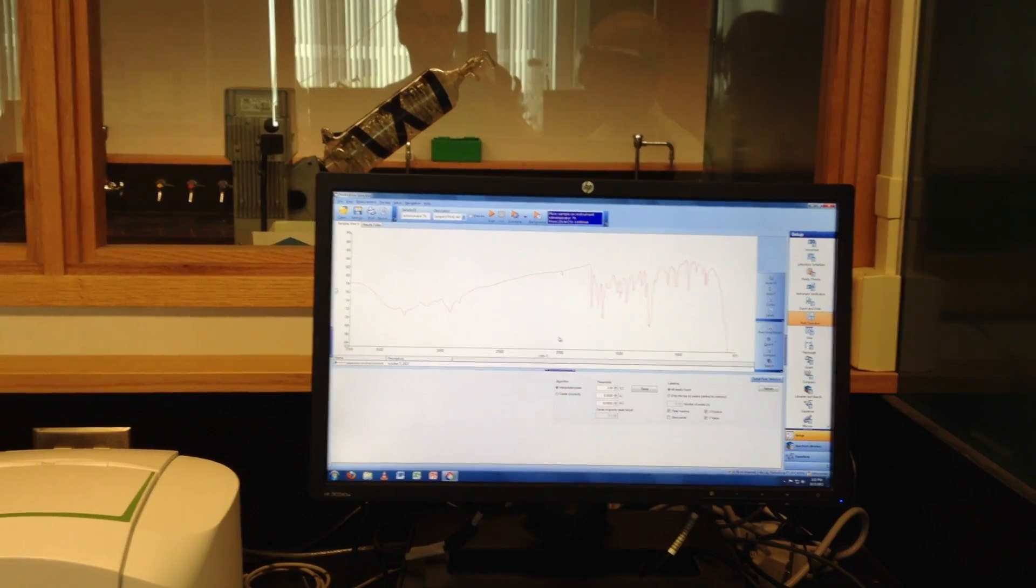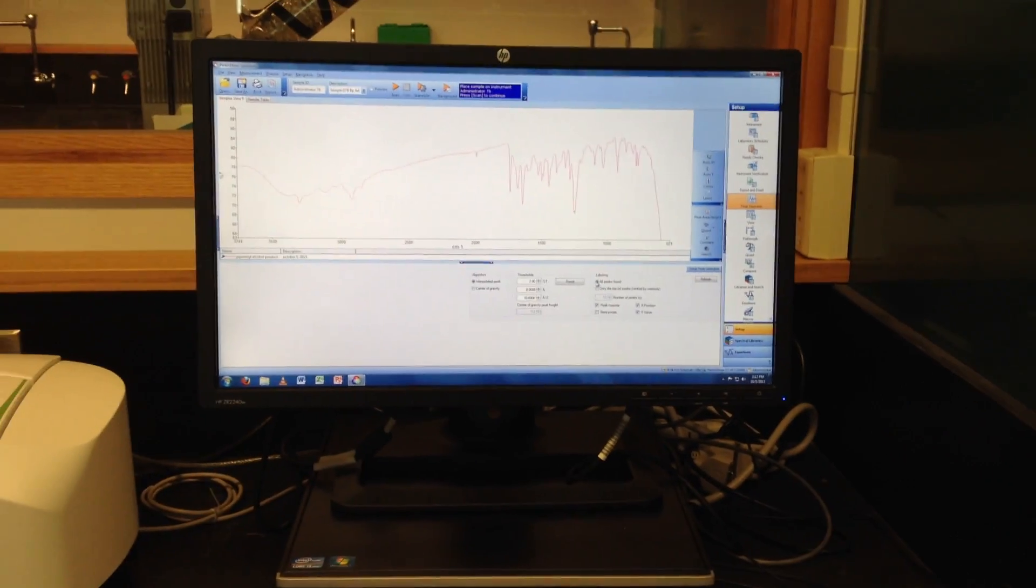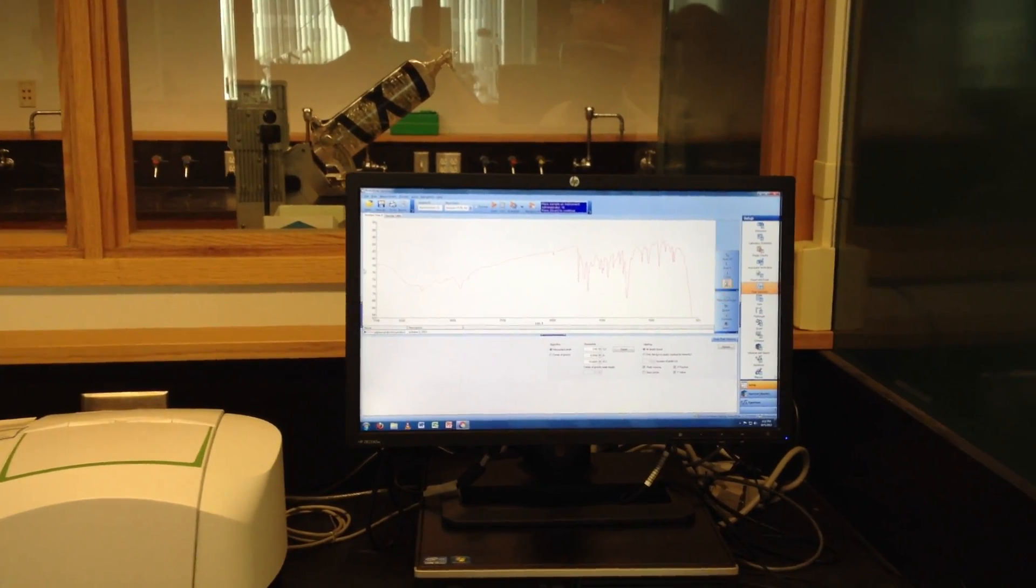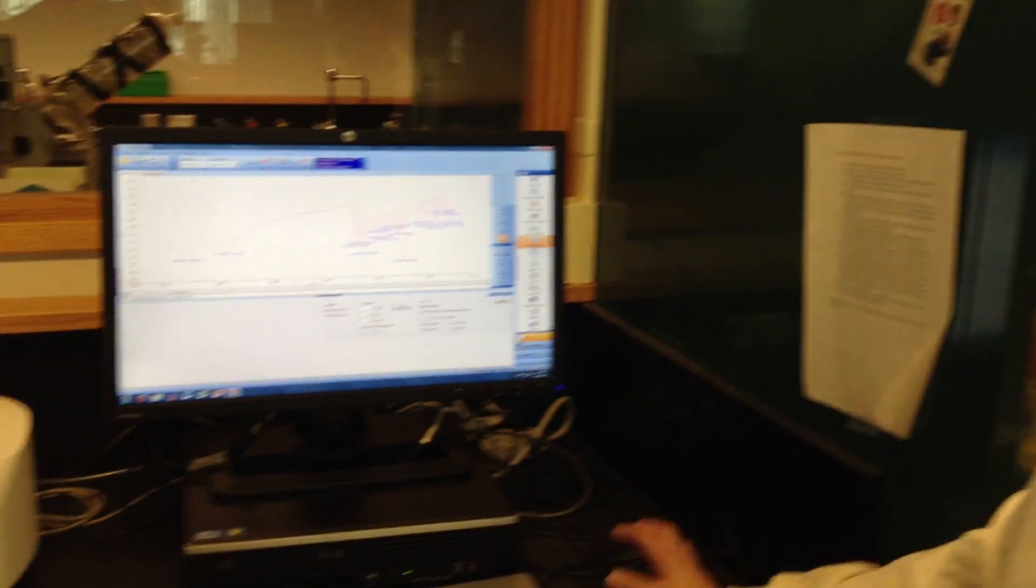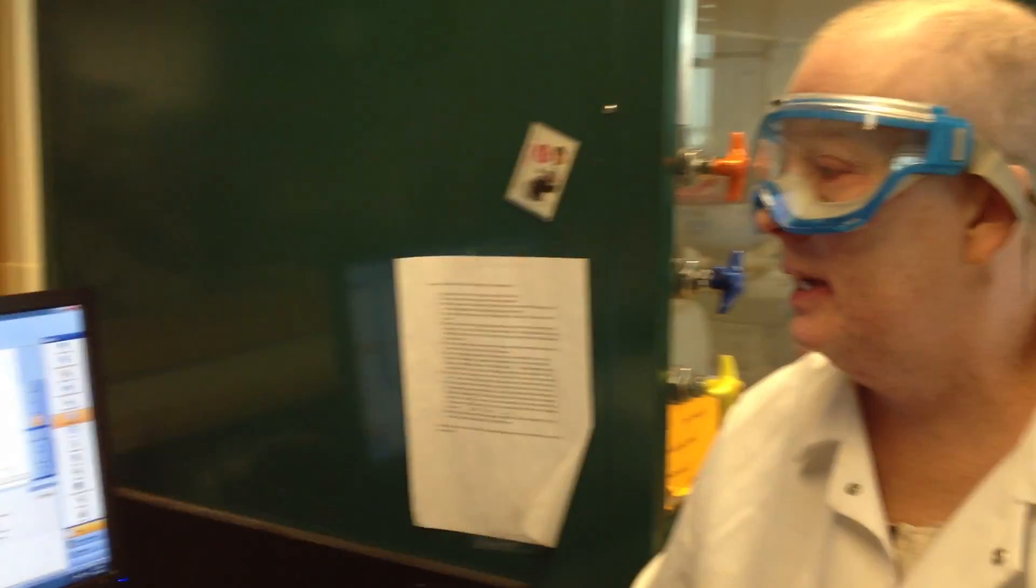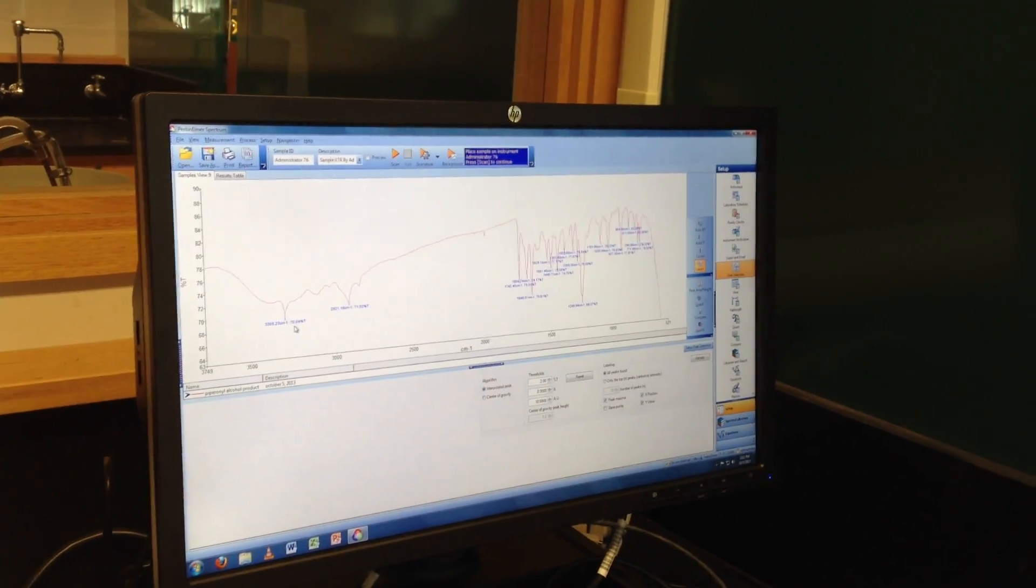What I'm going to do next is label it. This is a little tricky sometimes. Labeling can be done a couple different ways. You can label such that all the peaks that are found are labeled. So I'm going to click on labels. This isn't a bad label. What it gives you, basically, is it gives you all the peaks that it deems big enough to be peaks. It gives you the position of the peak in reciprocal centimeters or in wave numbers. And then it gives you the percent T, the percent transmittance. This is not a horrible spectrum for a solid, because solids tend to reflect a lot of light back. They particularly reflect the high-frequency end of the spectrum. That's why the spectrum has a bit of a tilt to it. But honestly, this is not bad. When I look at this new instrument, this is a beautiful-looking spectrum for a very small sample that I applied to that cell.